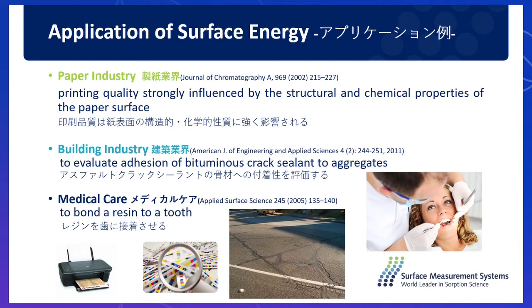In the building industry it is also used, because the aggregates which are used in the bitumen also have to have good adhesive properties. Surface energy is also used in medical care. Teeth have rather lower surface energy than the resins, the fillings, that they put in. So scientists designed the fillings to create a good bond with the teeth.